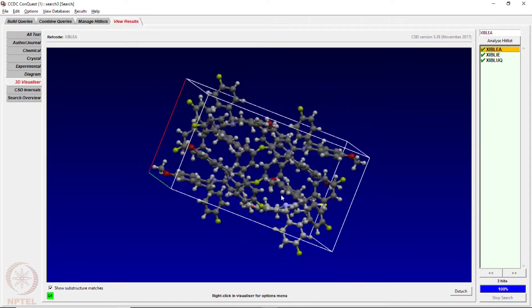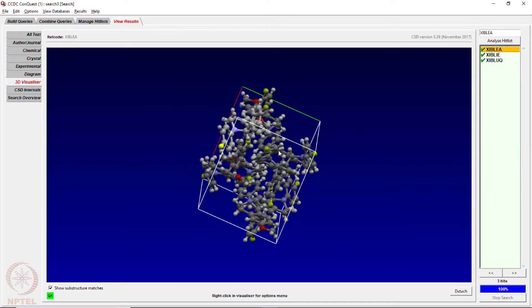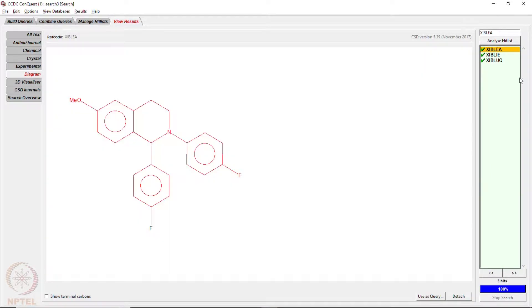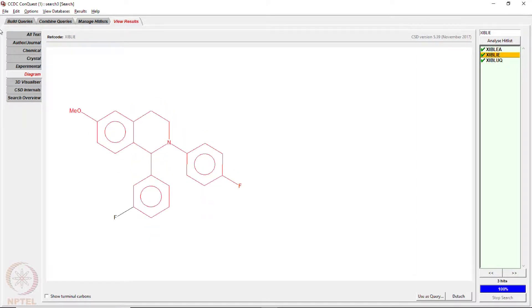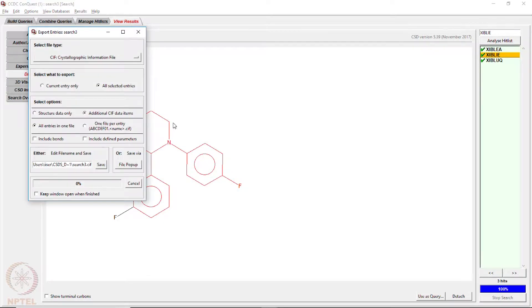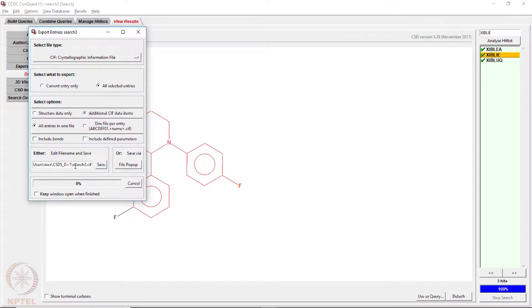You can see the packing of the molecule reported in the database. One can search what molecules are reported. If you want to download all CIF files, you go to file, export the entries into CIF format, change from crystallographic information file format, and download. It will save as 'search3D.cif' by default, and then you can open the CIF file using Mercury to generate packing diagrams, analyze structures, and more.